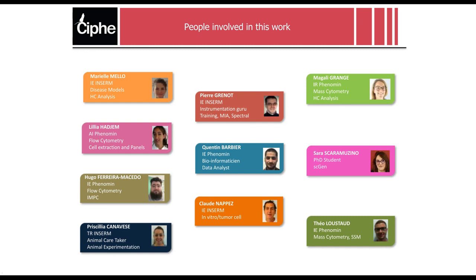Well, I hope for this webinar I managed to bring across that Cytobank is actually more than just a machine learning tool. It really allows you to efficiently dive through your datasets and also communicate with your colleagues, as either bioinformaticians or biologists of different areas, so that you come across together faster, you can build hypotheses faster, and then be more productive basically in your analysis scheme. So I hope I managed to do that.